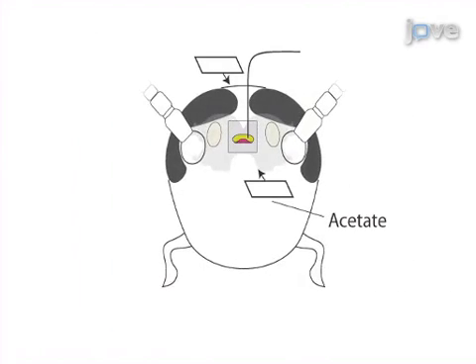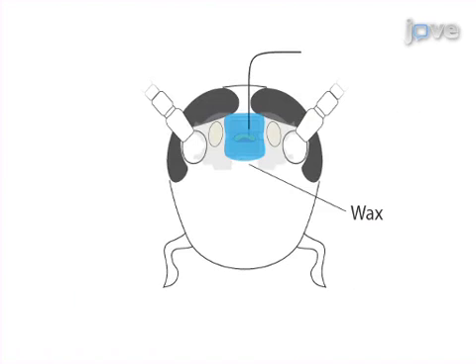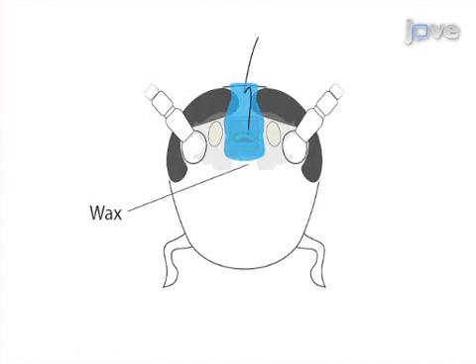The second step is to insert the recording tetrode into the brain, stabilize it with acetate and wax, and secure a strain relief loop to the head.